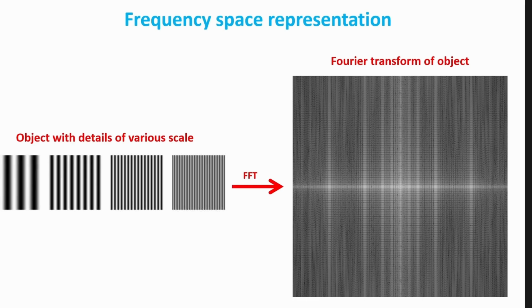It's actually being done. So what that means is that at the back focal plane of the lens, where the image is being formed, the size of this frequency space determines how high spatial frequencies we can let through the optical system.